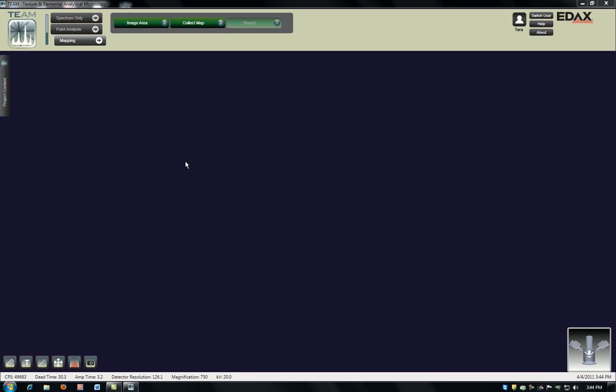Welcome to the EDAX Team EDS Map Collection software movie. This movie will be a quick start run-through covering the basics of how to quickly and easily get started in your map setup. The Team EDS software uses a series of smart defaults to help guide you through your collection setup.